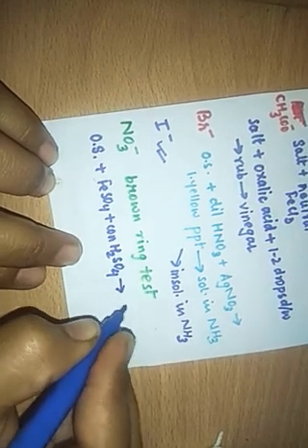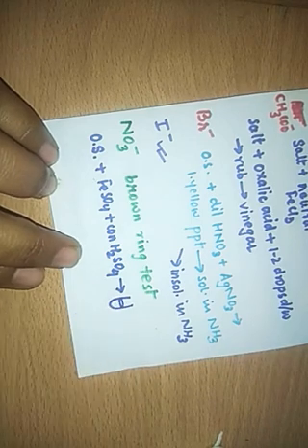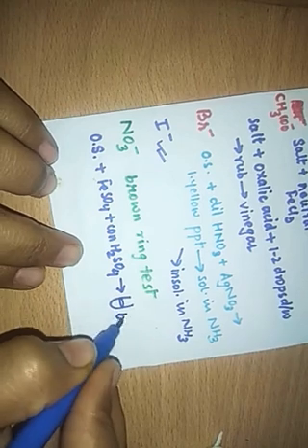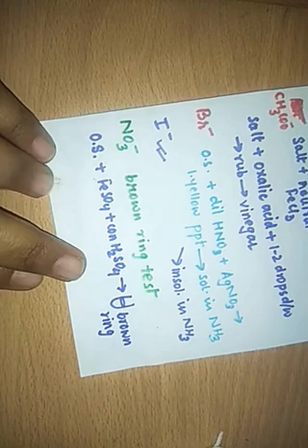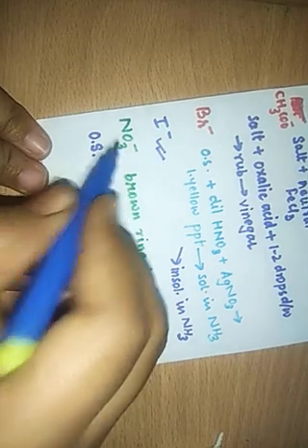When you do that, you will see that in the test tube there is a brown ring formation at the junction of the two solutions. This brown ring confirms it. If you disturb it, it will get dissolved, so you don't have to disturb it. So if the brown ring forms, then it confirms the presence of nitrate ion in the salt.